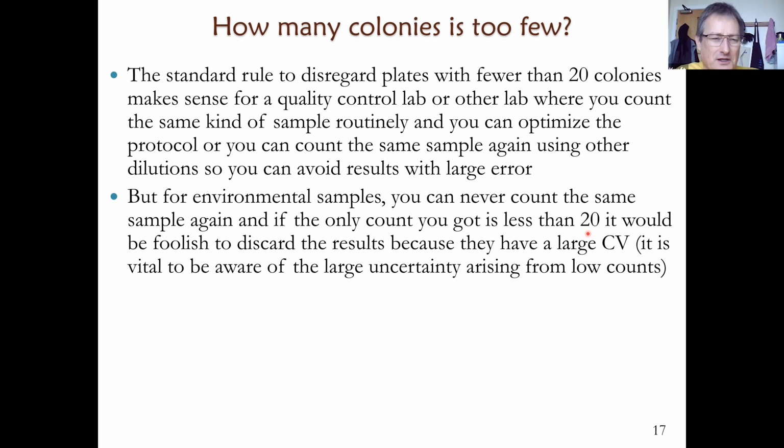And if the technical error is larger than the sampling error, you should use many independent dilutions and Gaussian statistics to estimate the error. Or better, reduce the technical error.